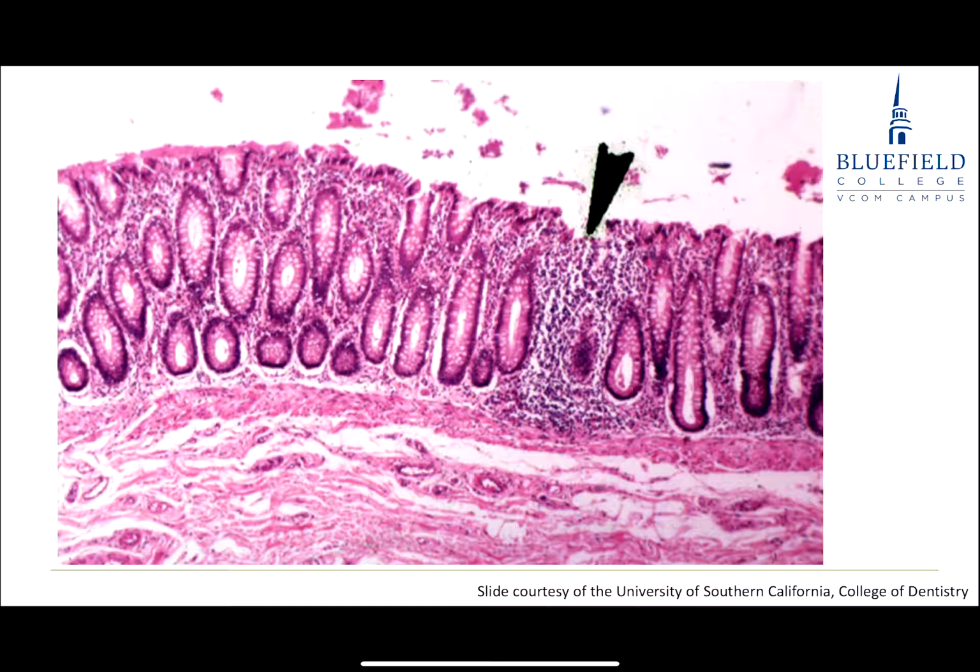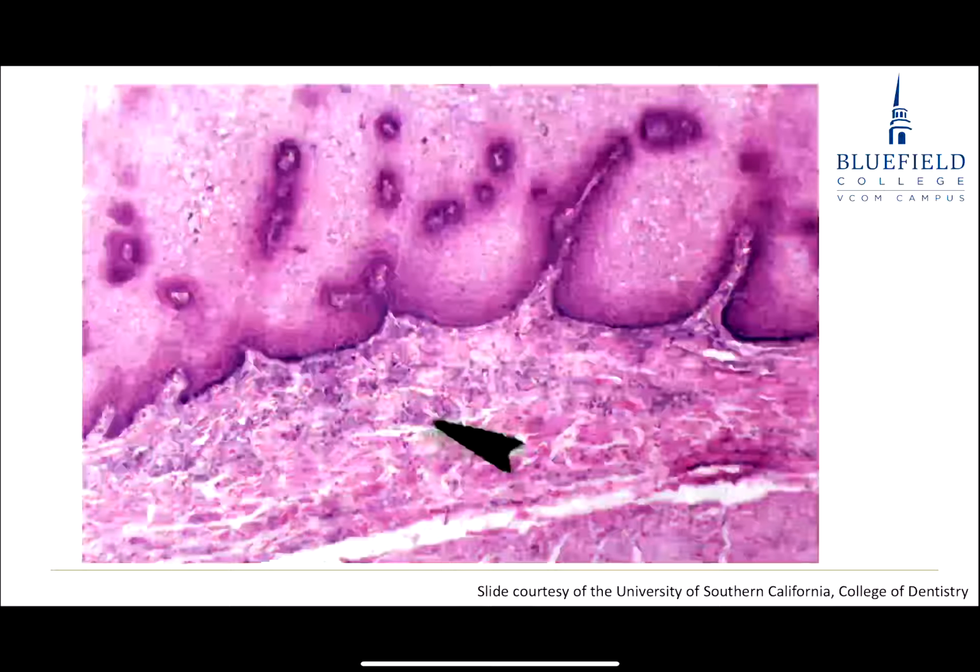And once again, you may be looking at large intestine, and all of a sudden I just see a region like that. Oh, I've got diffuse lymphatic tissue, plenty of bacteria within the large intestine. Well, they've made their way into the connective tissue through the epithelial lining, and you've got an immune response taking care of it. All right, but look right here. This looks like it could be the esophagus, hard to tell. And we've just got this region, a lot of little spots in here that have more nuclei than they should. Okay, that's diffuse lymphatic tissue.